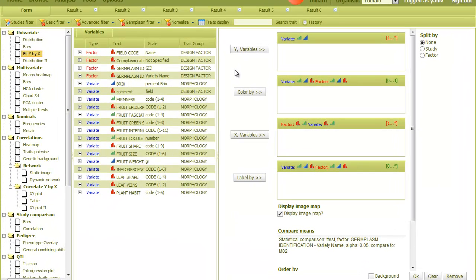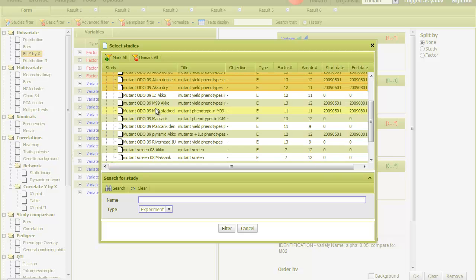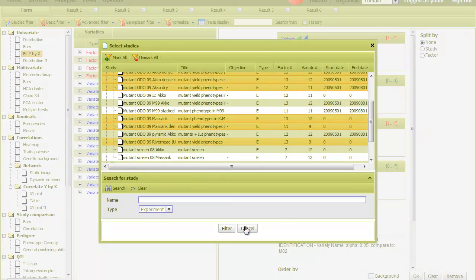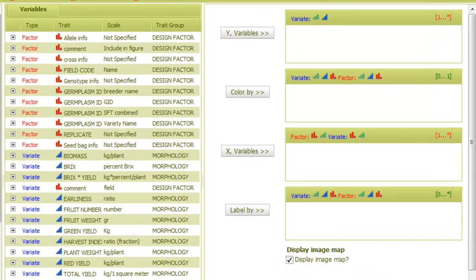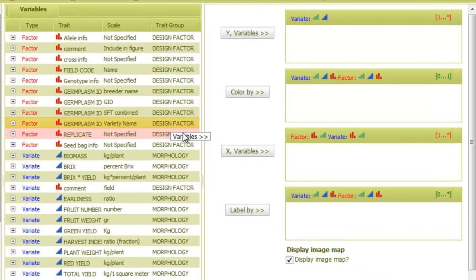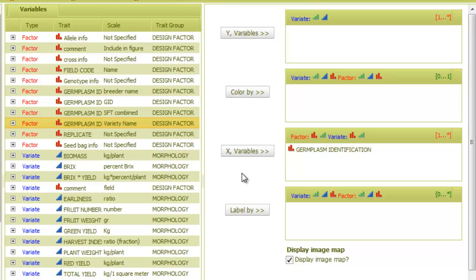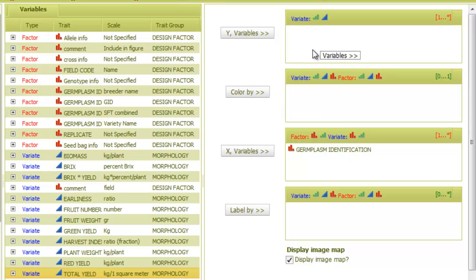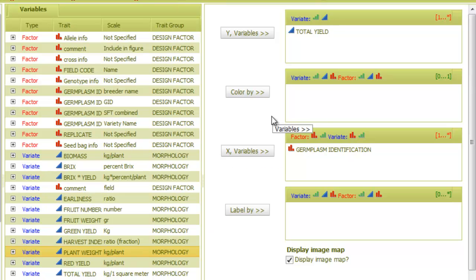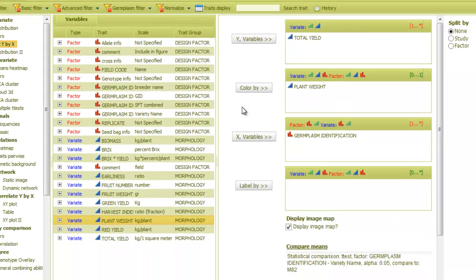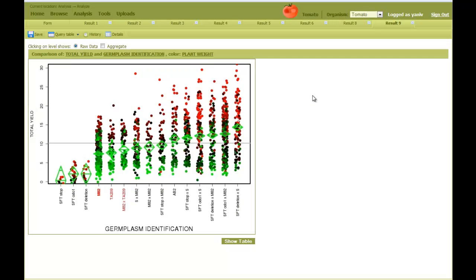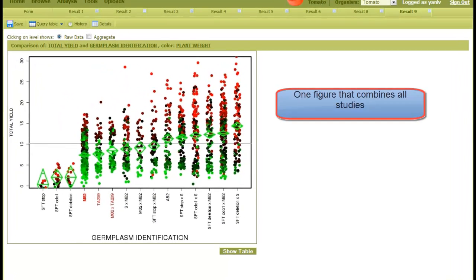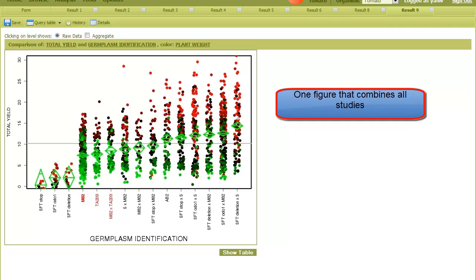Next, I'll compare genotypes that were measured in several replicated trials. First, I'll select the studies, then I put the variety factor in the X field, and the trait yield in the Y. Also, let's color data points according to the plant weight. The results and the statistics are performed on the combined data set.